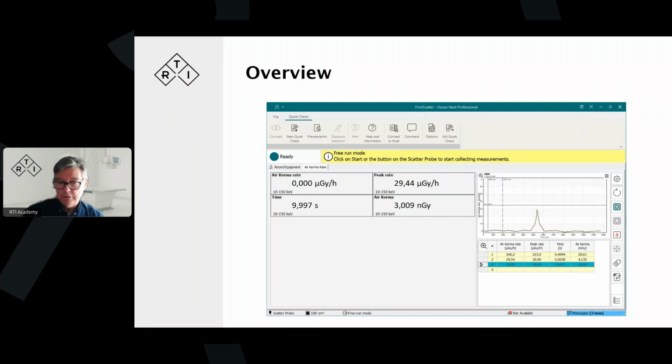If you just want to get out of there, submit a paper and move out, then you can fiddle around like a ping pong racket, sign off and do something else. But if you want to measure properly, you need to take your time to do it.